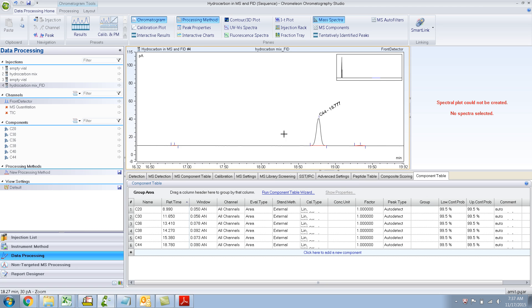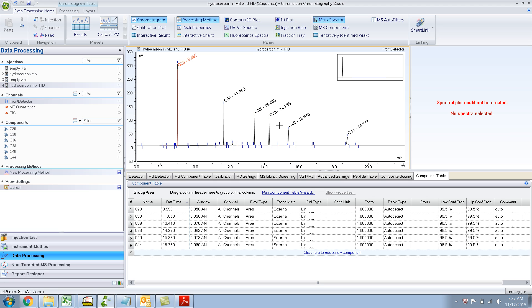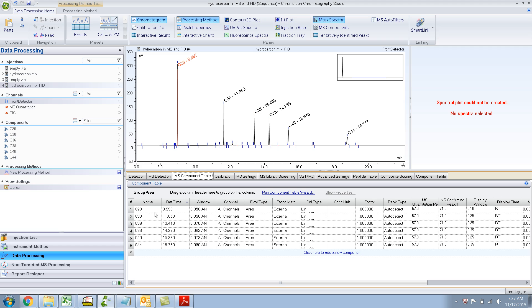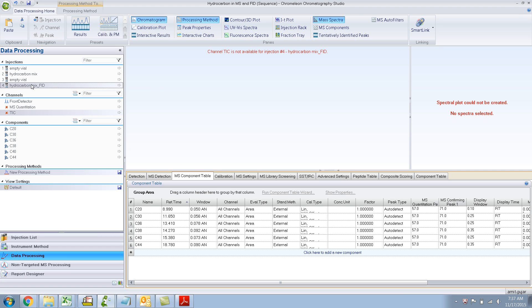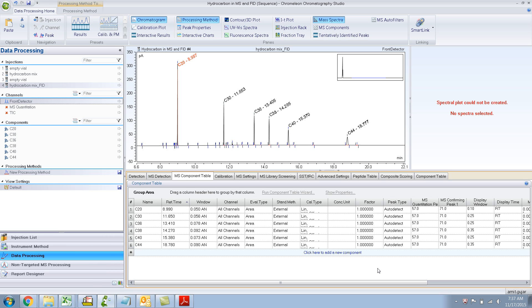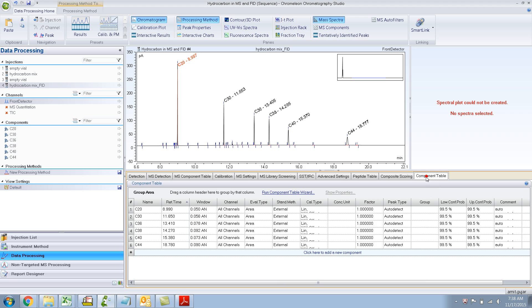This is in the FID channel. There can be only one component table - it can be either the MS component table. The MS component table also has the same retention times that we entered. So if I go back to my previous injection and select the TIC, it's not going to detect it because the retention times have shifted and we changed them. The component table for FID shows a molecule icon without a green check mark or exclamation mark.